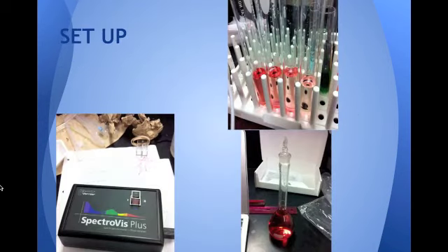So here are some pictures depicting the setup of our lab. So on the left we have a picture of the spectrometer used, and as I explained earlier, this basically measures how much light passes through a sample of liquid. On the right, we have two pictures depicting the different concentrations of solutions that we made.